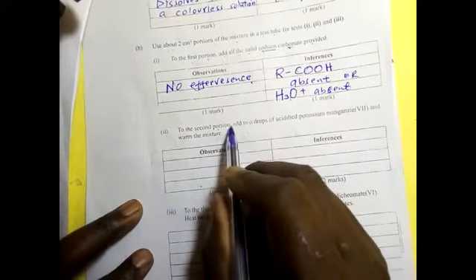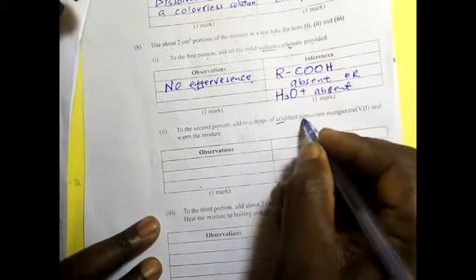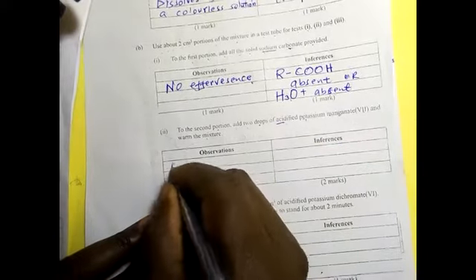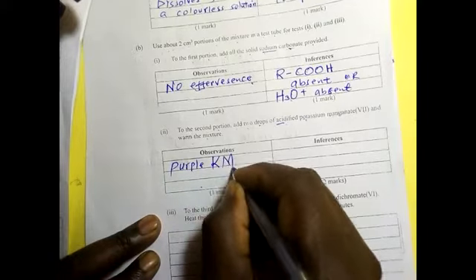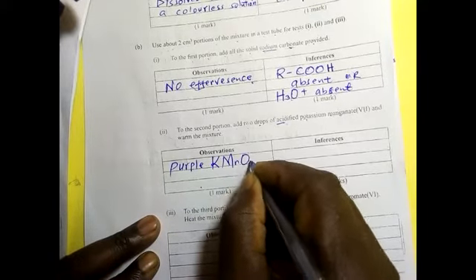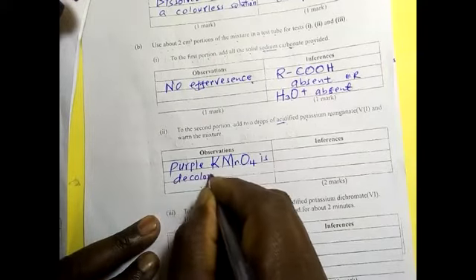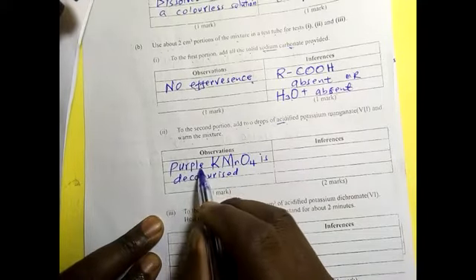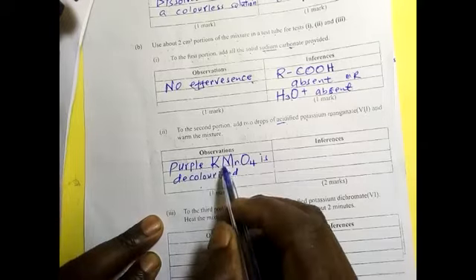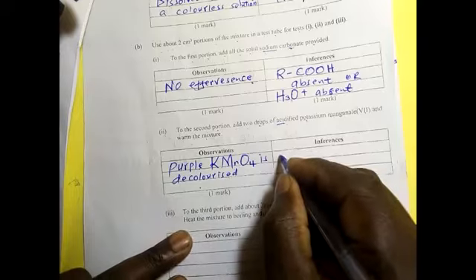To the second portion, add 2 drops of acidified potassium permanganate. Warm the mixture. Remember, acidified potassium permanganate is purple. So the purple acidified potassium permanganate is decolorized, meaning that the purple color changes to colorless. That's what it means.